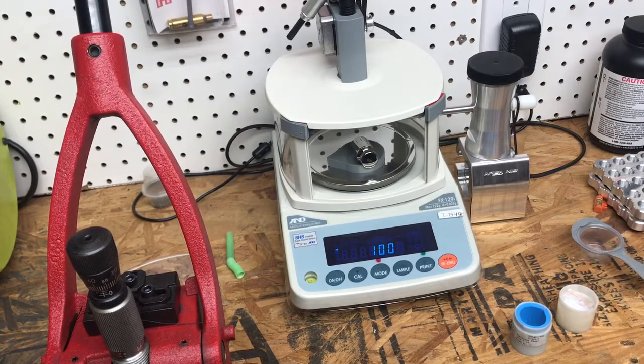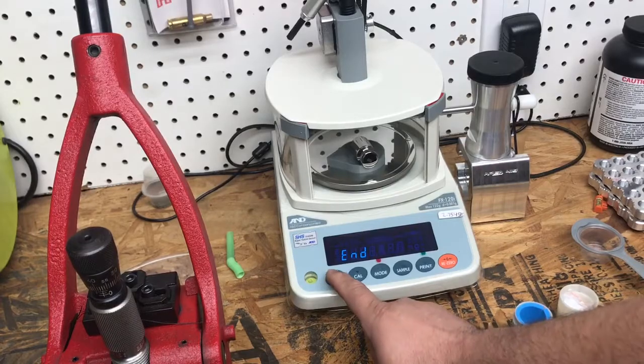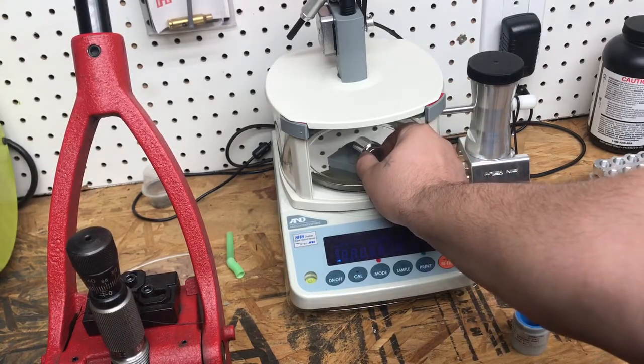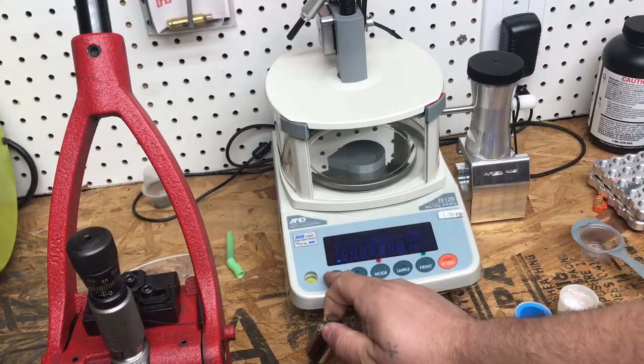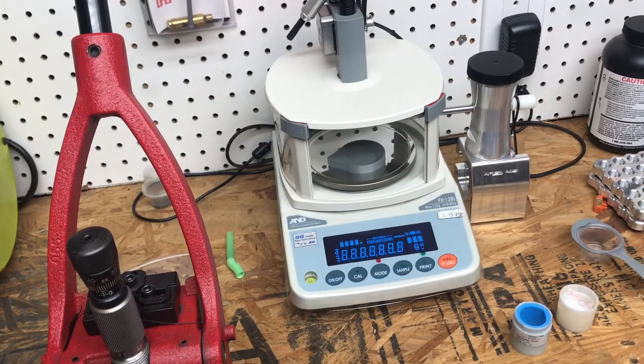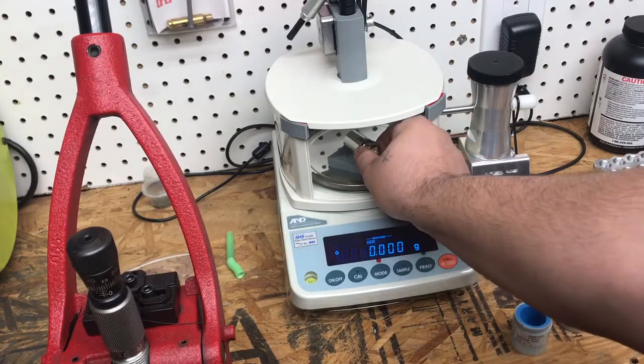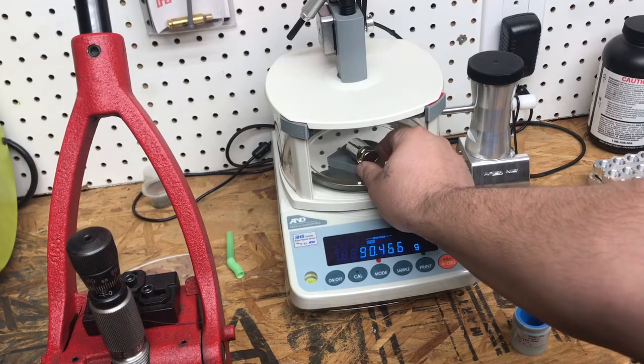Wait until the display shows 'End'. When it displays 'End', turn off the unit with the on/off button, remove the weight, and power the unit back on. Now it's calibrated. You can put the weight back on to check the calibration.